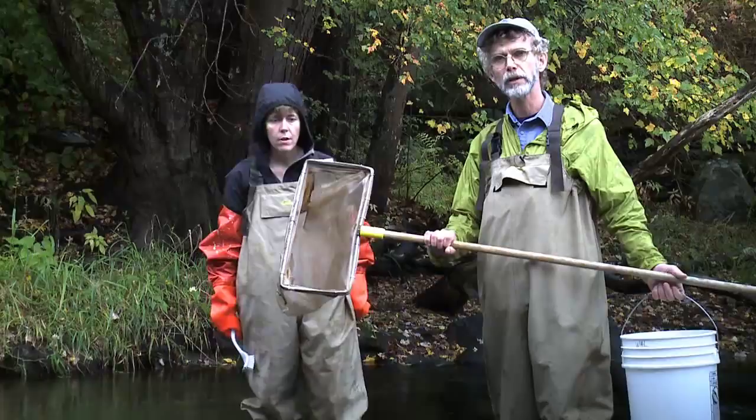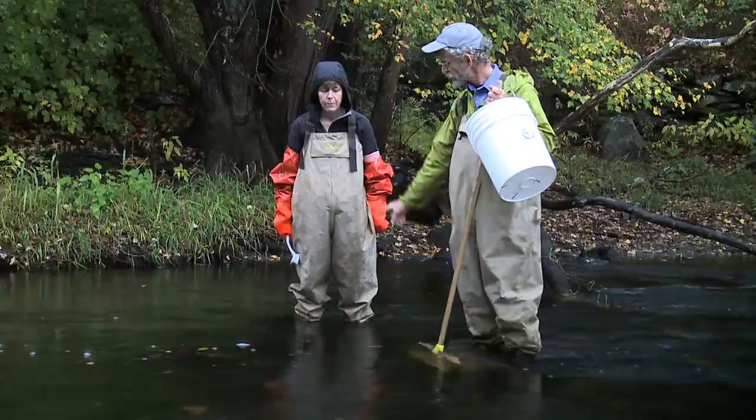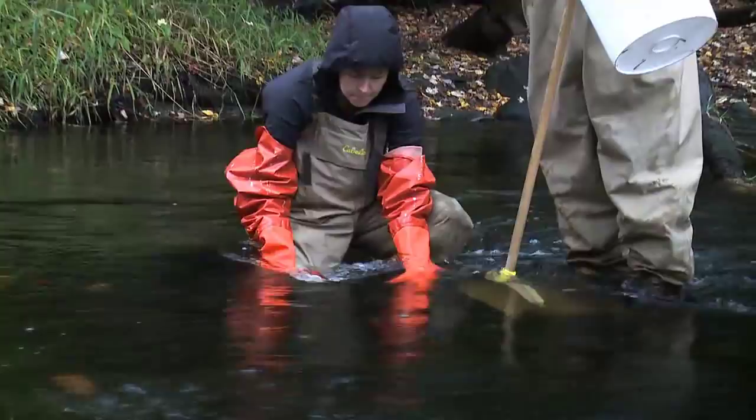You need a number 30 mesh net or 500 micron net, and we put that into the stream to capture the insects that are going to be dug up on the bottom. Kim is going to use these gloves and a brush to dig up the insects on the bottom so that they flow into the net.